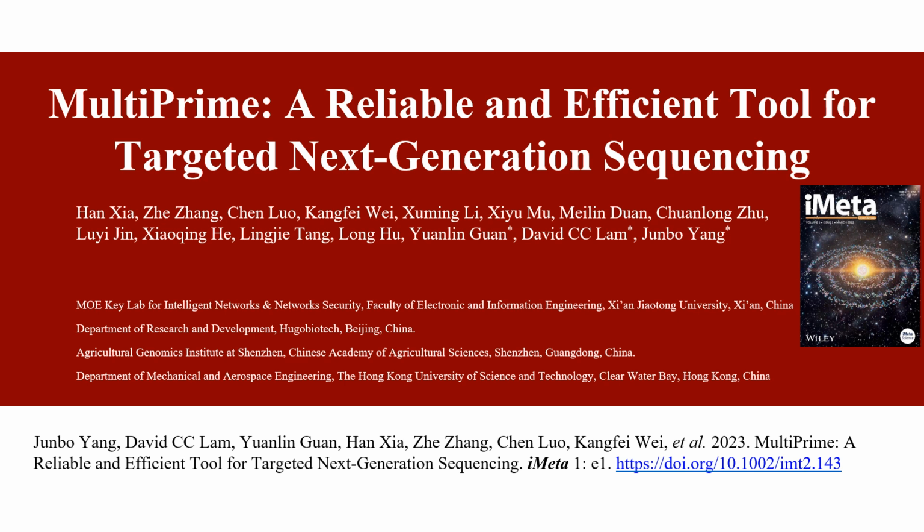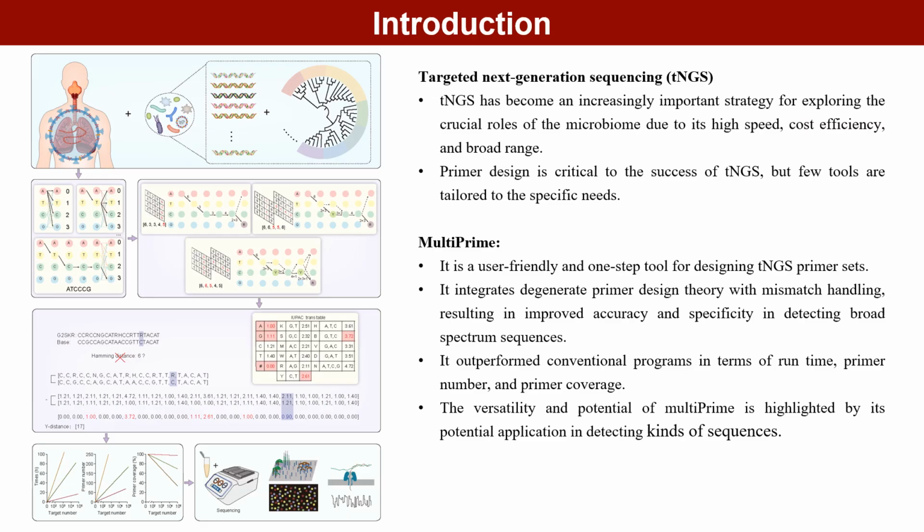Good day, everyone. I'm glad to present this recent publication from our team in iMeta. Our study's title was multiPrime, a reliable and efficient tool for targeted next-generation sequencing.